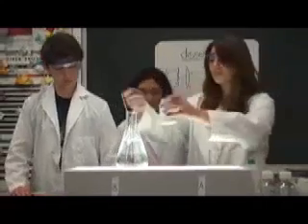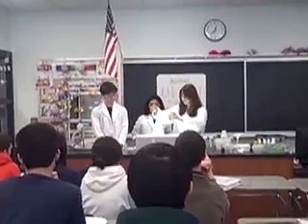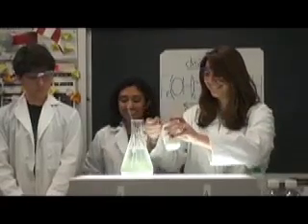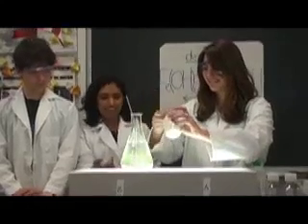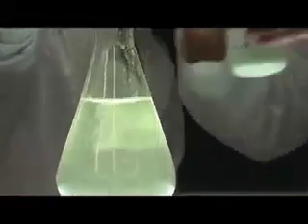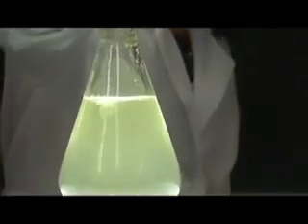First, we start by dissolving the compound iron 2 chloride in water. The polarity of the water molecules is causing the solute to dissociate, or separate, into its ions. The positive ends of the water molecules attract the anions, and the negative ends attach to the cations and pull away the cations. Whoa, look at that bright yellow! The bright color appears because iron is a transition metal, and typically transition metals will form a colorful solution or precipitate. So now we'll move on to precipitate.